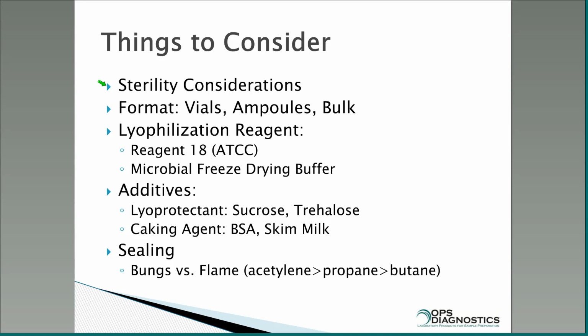The reason I say that is, just like a culture collection, you're going to have 1 million organisms per mil or even more in that little vial. You're going to rehydrate it. In other words, it's going to be a solid material after freeze drying. You're going to add some water to it, it's going to go into solution, you're going to take a loopful out, and you're going to streak it. If there's 1 or 2 microbes in that sample that somehow made their way in there, they're going to be outcompeted, hopefully, by the other bugs that survive.